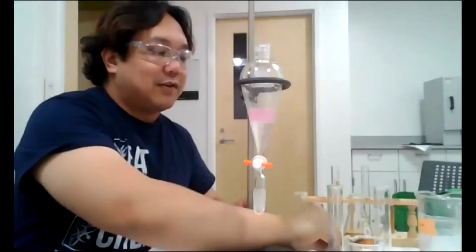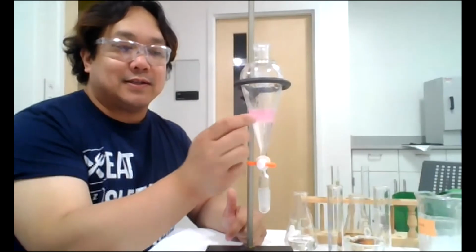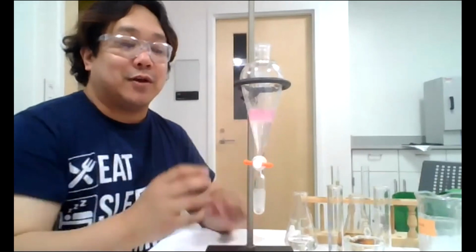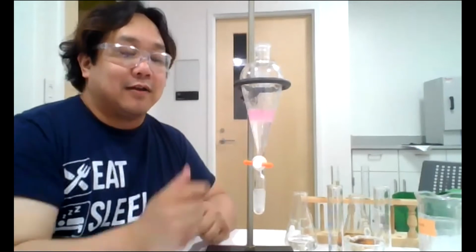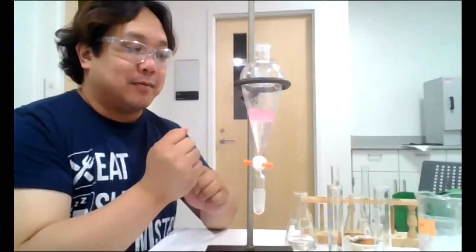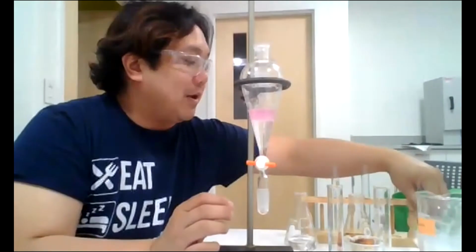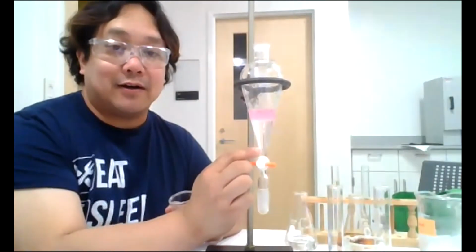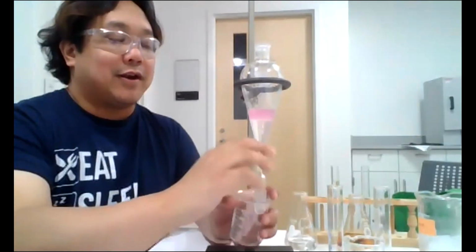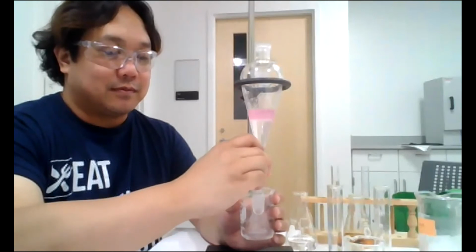We know that the second serving still did something because, look, the cyclohexane is still pink. So it was able to extract more iodine from our first shake-vent procedure. So that's what I'm collecting here. I have a new beaker. Now that I know that I'm analyzing this layer, I want to be very careful and not get any of the organic layer with any of the pink solution.